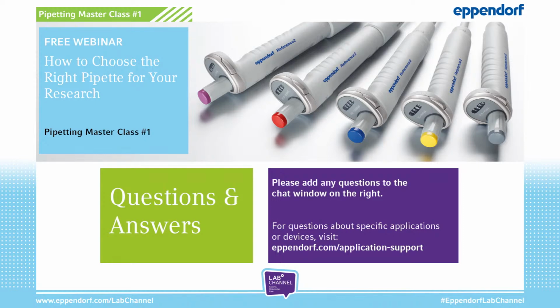Take it, aspirate water, and wait 1 minute. You should not see any drop formation outside the tip after 1 minute. This is the first sign, let's say, that the fitting of tip and pipette is still good.